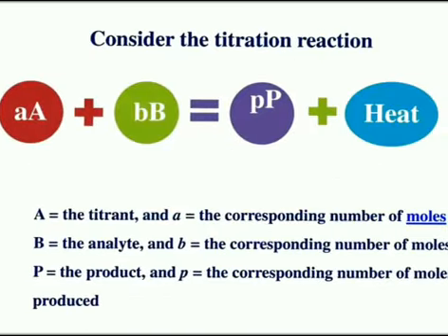Say for example, consider the titration reaction between A and B that gives the product P plus heat.